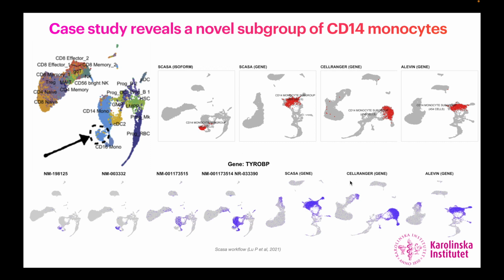At gene level, differential expression effects were being masked. And as a result, the cells from this subgroup share a more similar phenotype at gene level and were diffused back into the main CD14 monocyte population, as you can see from here.